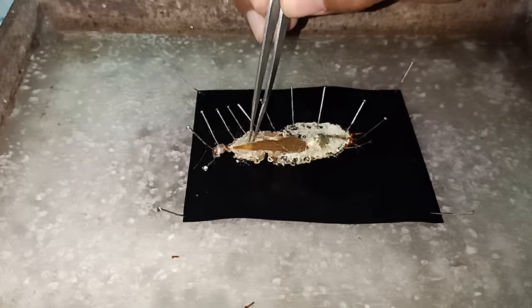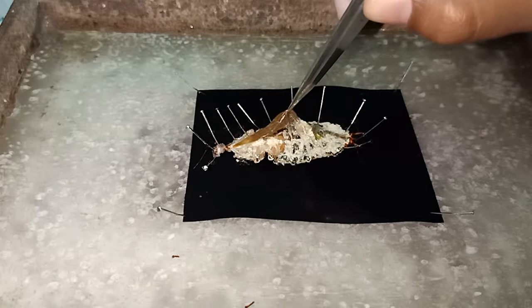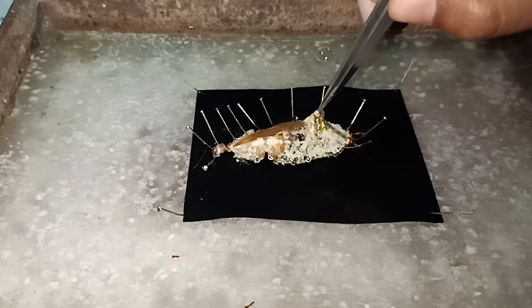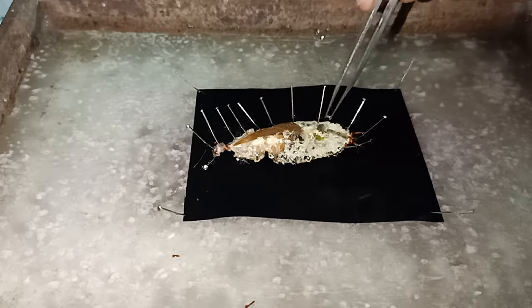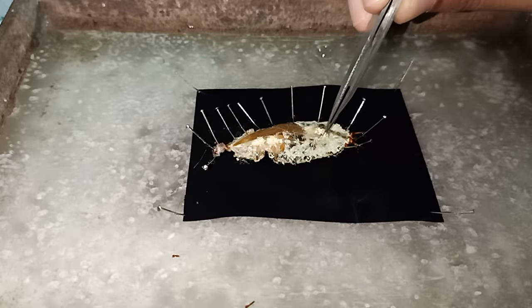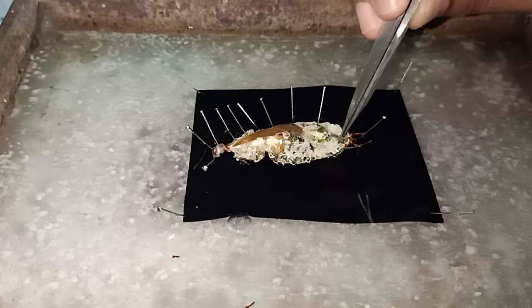While removing the digestive system, make sure that you do not damage the nervous system and the brain present behind the digestive system. The digestive system must be removed starting from the esophagus along with the salivary glands till the rectum.